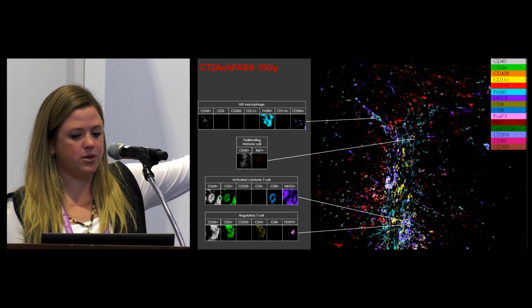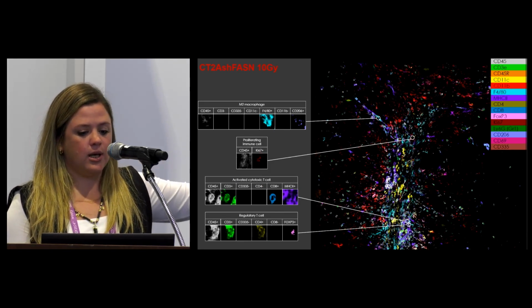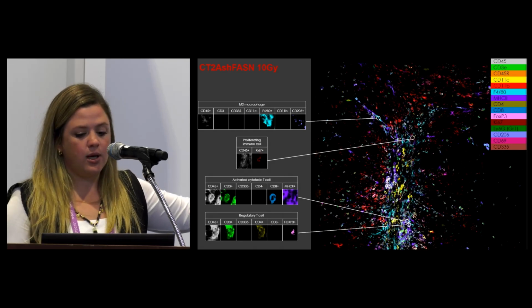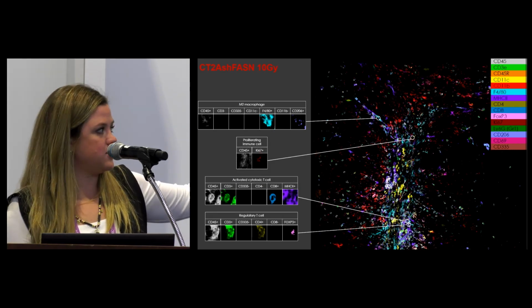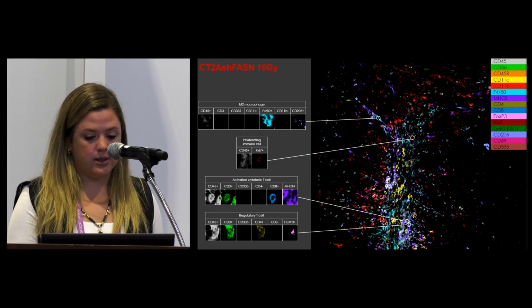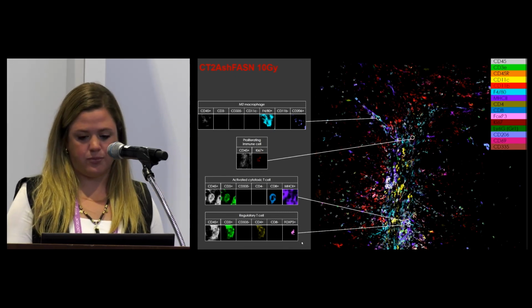So you see expression of CD45, F480, and CD206. We can also detect proliferating immune cells through Ki67. We could see a lot of CD8 T cells in these tumors, which is important for us, and I will show you later. We could also detect some Tregs, where you can see the expression of CD4 and FOXP3.